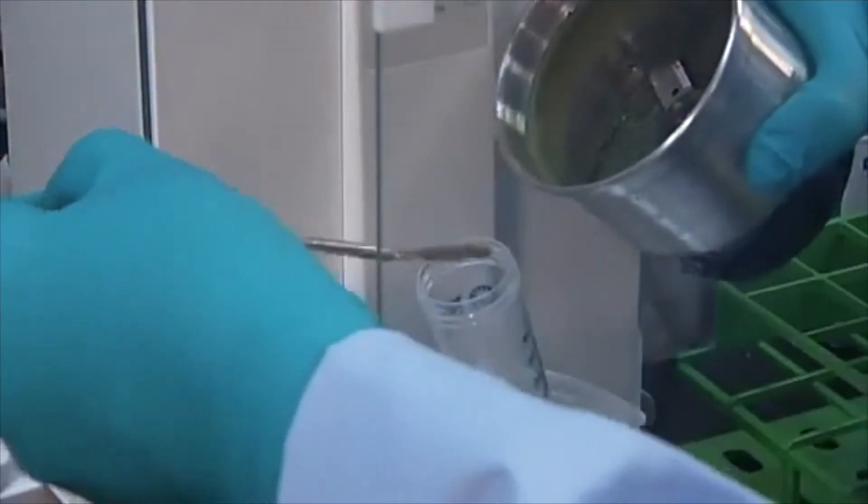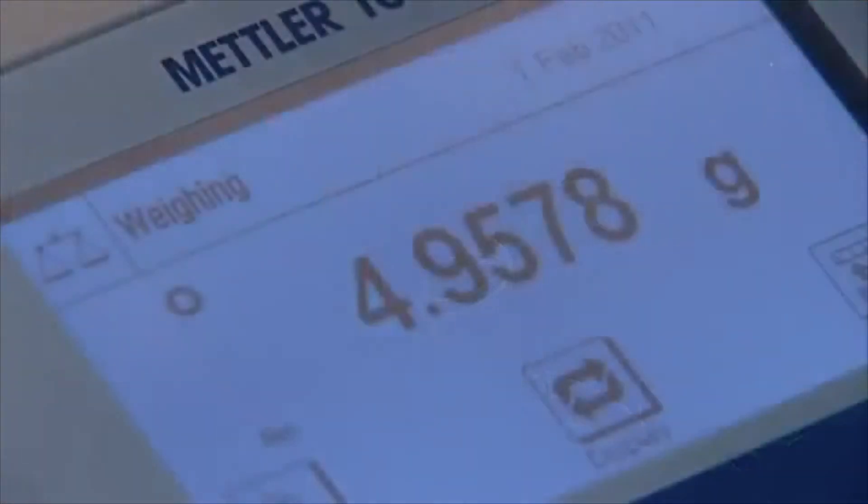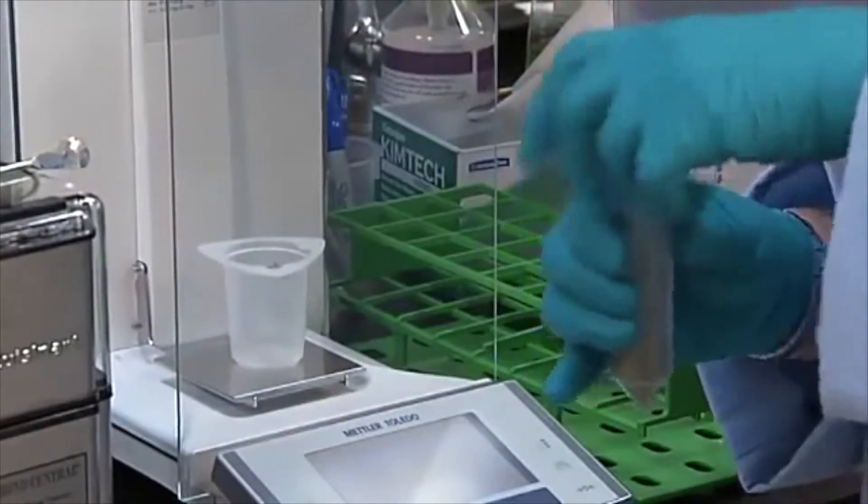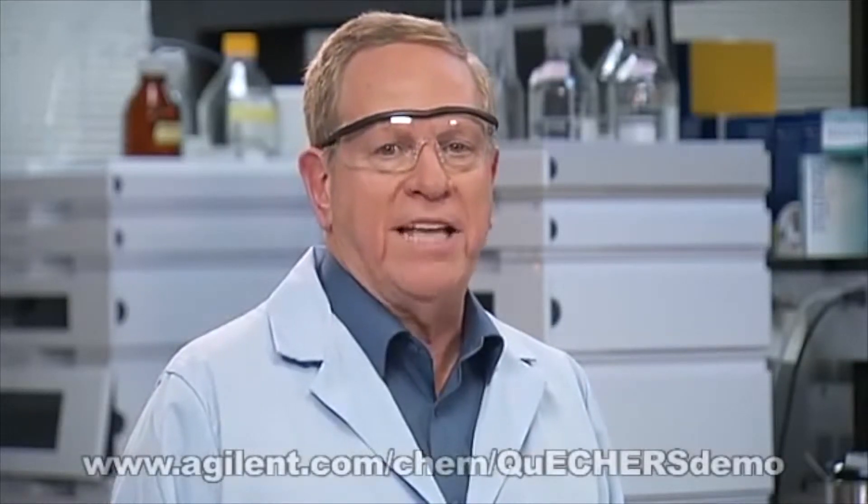Weigh a specific amount, usually 10 or 15 grams, of the ground sample into a 50 milliliter centrifuge tube. If your sample is a fresh fruit or vegetable, you are ready to continue with step one, the acetonitrile salting out or partitioning process. To learn more about using QuEChERS with fresh fruit and vegetable samples, view our first QuEChERS video available at the link on the screen.